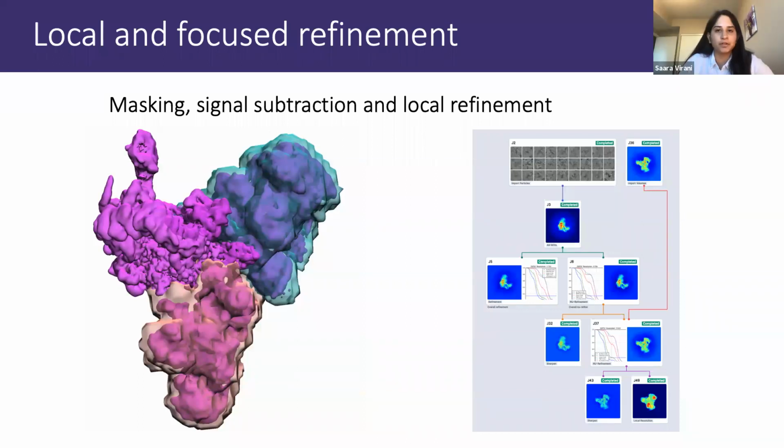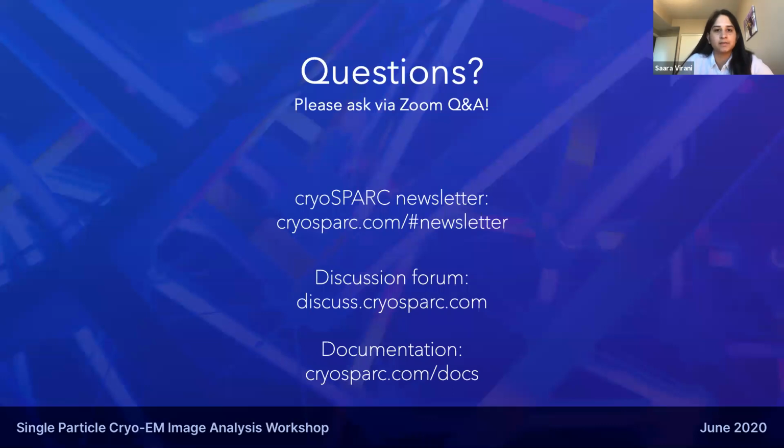Awesome. We did have a few questions that have been hanging that I wanted to address if we had time. Sure. Taking us back a little bit to the beginning, when we're looking at particle picking in a crowded micrograph scenario, and we did the example with the AAA plus Unfoldase where we did windowing to make sure that we can see individual particles in each of our classes, those are just masked. Don't we need to re-pick from the data set with a smaller box size, or rather re-extract with a smaller box size? That's a good question.